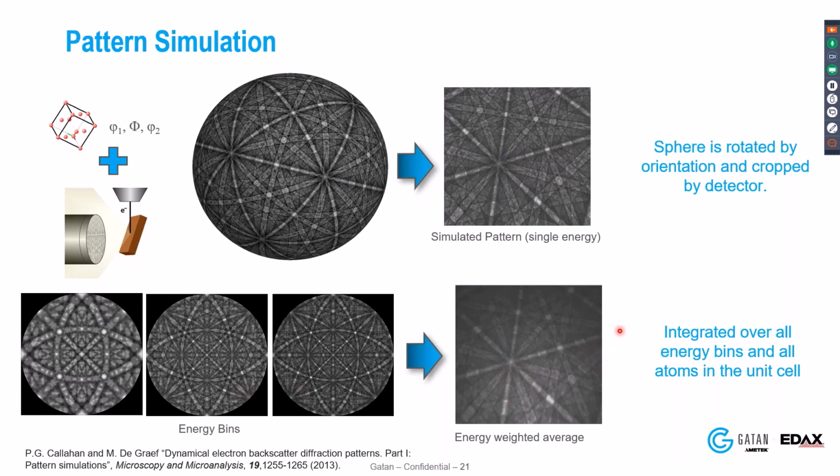And so this has worked really well. Again, we do want to know as best as possible what our detector size and geometry are, and we want to know the pattern center to be able to simulate this pattern. We want our simulation to match our experimental as best as possible. So this geometry is basically tracked across the system from acquisition. It's saved in the data and can be used for the spherical indexing automatically. But that's something that can have a strong effect. That's why we keep it all in there.